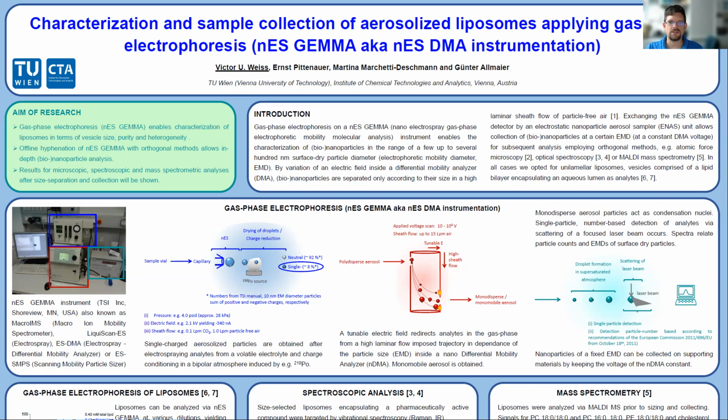The aim of my poster is to demonstrate that liposome characterization is possible via gas phase electrophoresis. You will gather information concerning vesicle purity, vesicle size, and sample heterogeneity. In addition, it's possible to offline hyphenate gas phase electrophoresis with other analytical techniques, for instance, atomic force microscopy, spectroscopic, or mass spectrometric techniques.